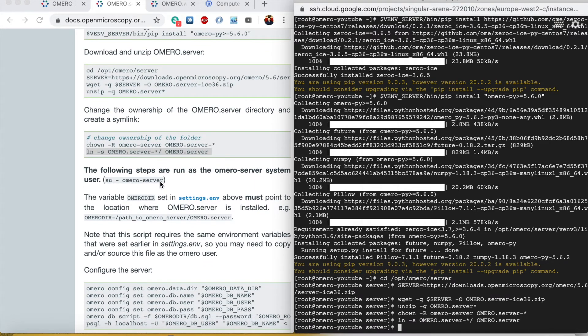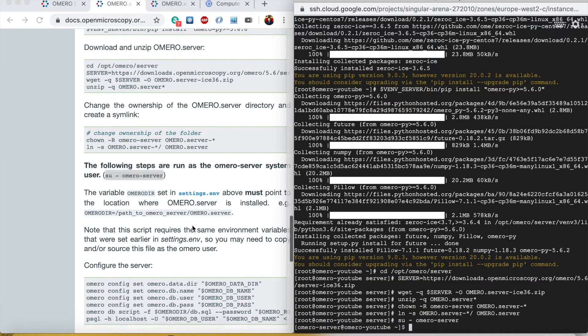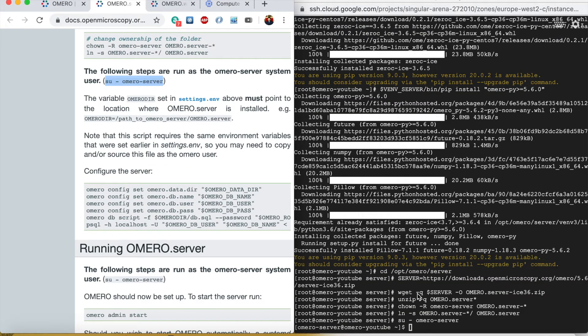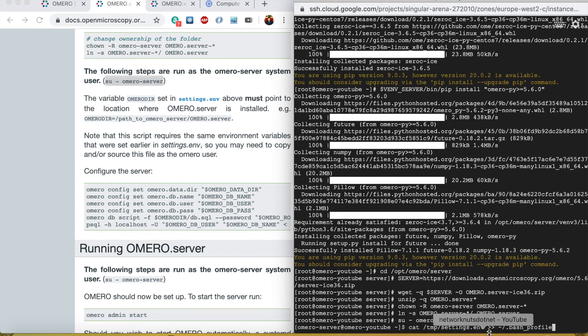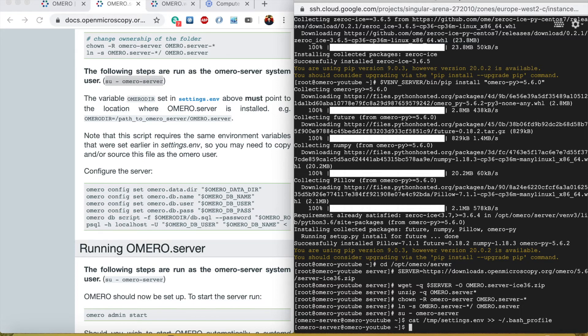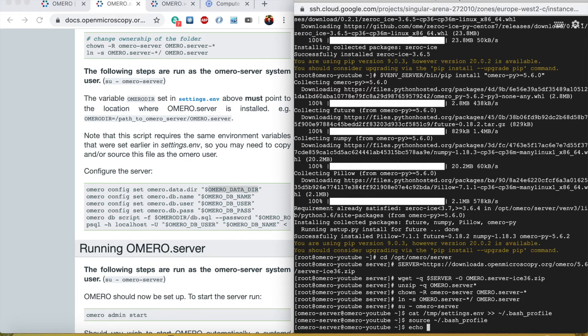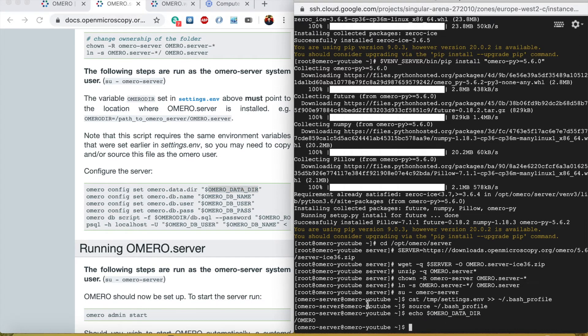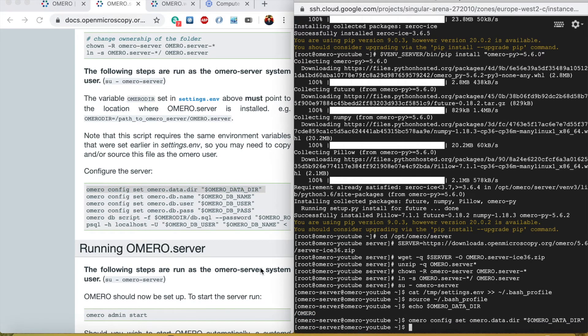Now we need to log in as OMERO server user that we created in the early step. What we need to do is make sure that the same variables are also available to the OMERO server user. To do this we can do the same tmp/settings.env file into the bash_profile of the OMERO server user and then we will do source .bash_profile. We will check again just to make sure that these variables are available. Yes, they are pointing to the correct location. Now we can copy paste all of them.